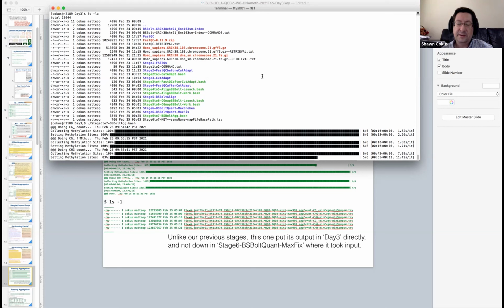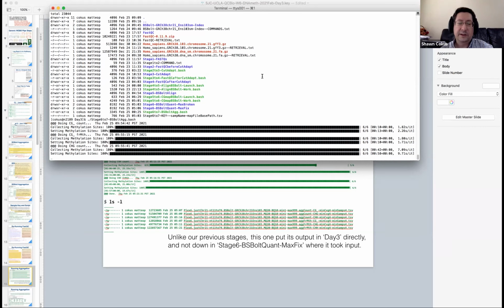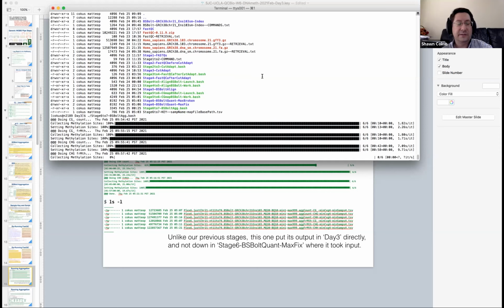It's grinding away. We could actually start looking at the output files. If you open a second Hoffman window, we can poke around and look at the output files while it's still making them. Since we're not running this in the job submission, the primary disadvantage, I suppose, is that our session's busy while this is running, so we can't go exploring around.